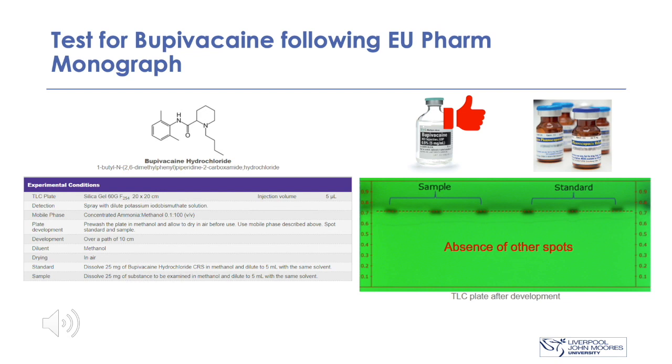The absence of other spots in the TLC tells you that apart from bupivacaine, there's nothing else. So this is desirable. So in this case, we will have a perfectly compliant product which we can put in the market.